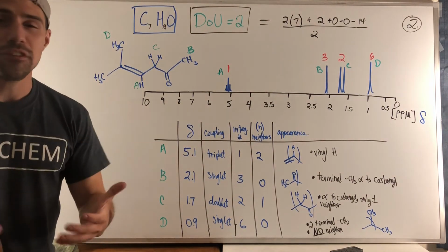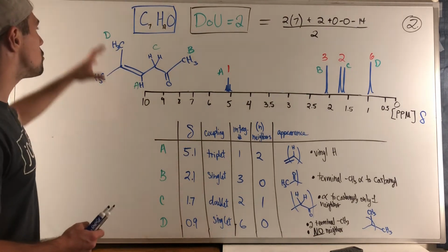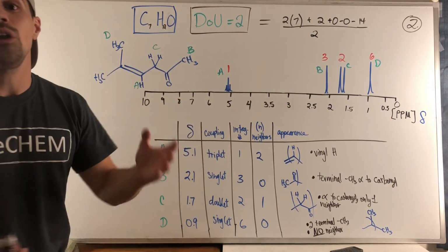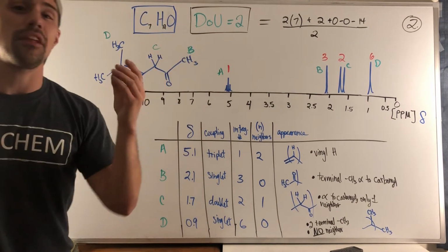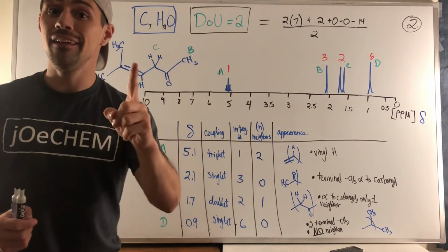And I feel like most of these problems, I hope, unless it's a ring with a ton of symmetry, if you can chew off one end and then find the other, the middle kind of works itself out. Or you can at least get something on paper, be confident in your ends, and then figure the middle out, okay? So that was problem 2, on to 3.